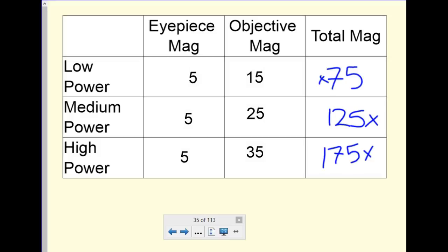Do you think that this microscope is the strongest magnification equipment in the whole world? No. How many times do you think we have the capability to magnify an image? 10,000. Yes. That is right. About 100,000 times. Oh, holy crap.